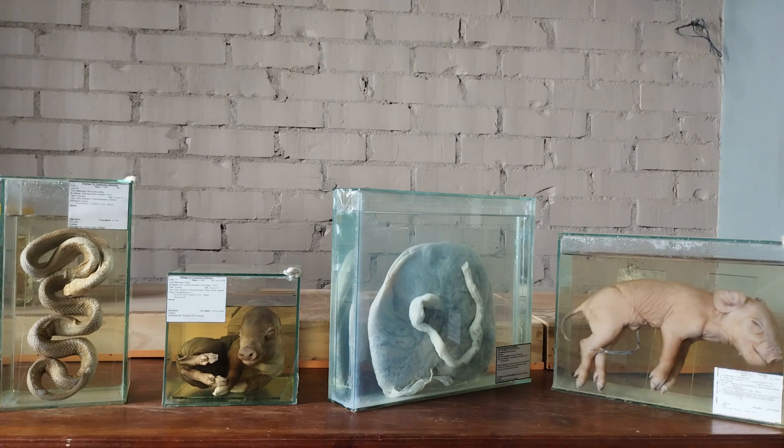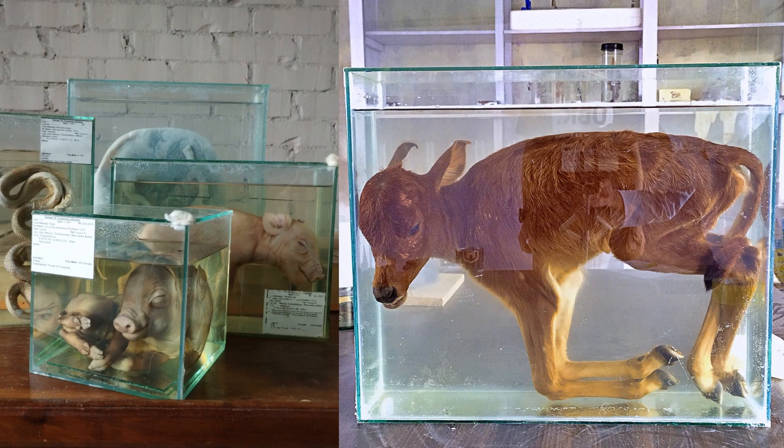And two, size doesn't matter with this type of container, unlike many other commercial specimen jars, because one can always make a fish tank of any size depending upon how big or small the specimen is. As you can see here, I've custom-made and used fish tanks for all sizes. The size of the tank for this newborn calf, for instance, is approximately 70 cm in length by 15 cm width by 50 cm height.